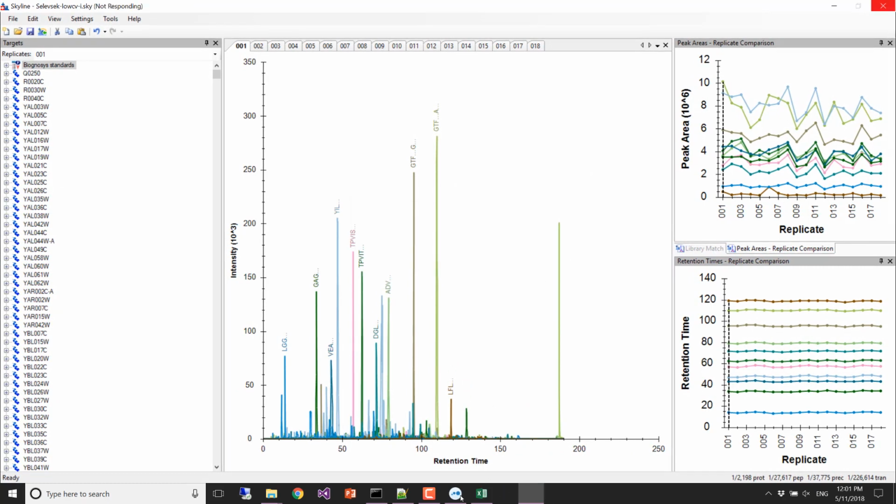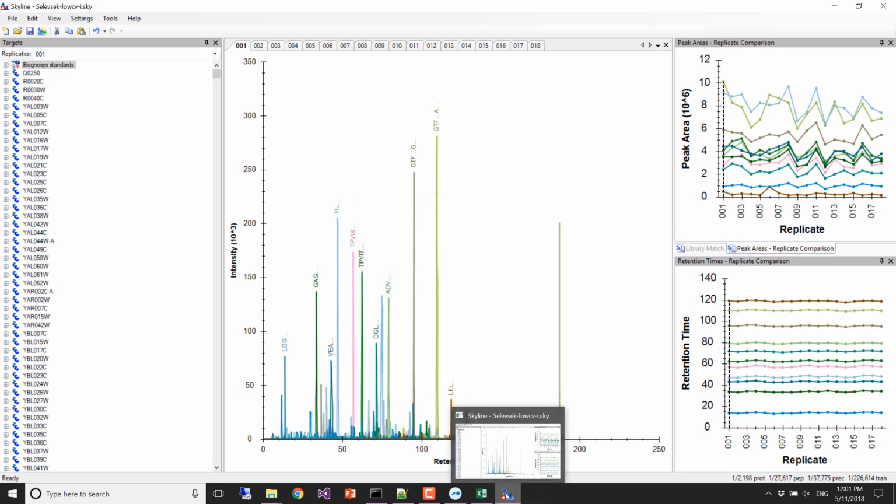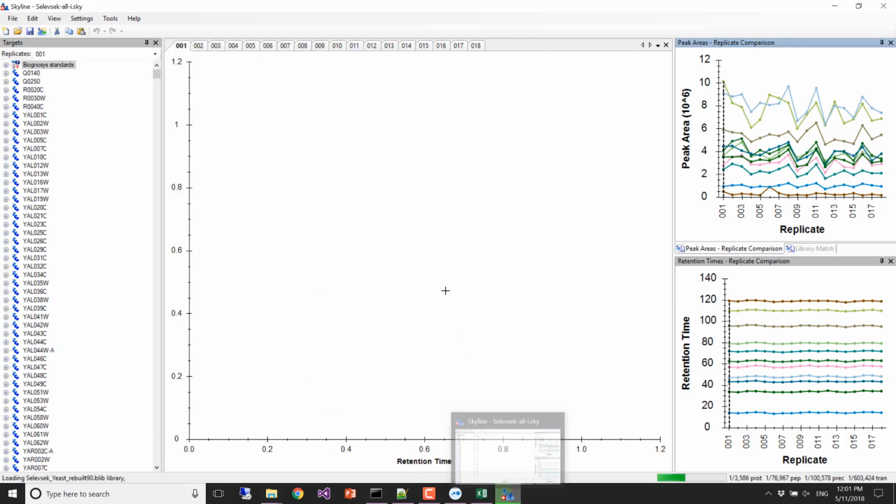What are the set of things you call significant in terms of between group comparison in one case or the other, and do they overlap? Do you find new things because of the lower multiple testing correction bias in your refined data and that kind of stuff? And that would be interesting to know.